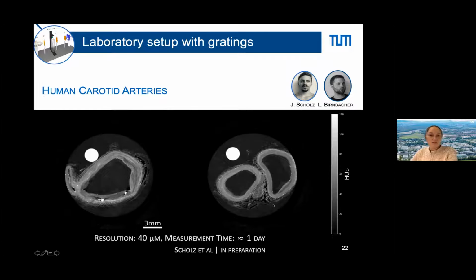This was done by optimizing all the components so that you can now scan not with stop and scan, step and shoot, but with everything continuously rotating. So all these optimizations are done, and we end up with around 11 hours, which is still a lot. But anyone working with a micro CT will know that for a high resolution and high quality scan, you need to scan at least several hours.